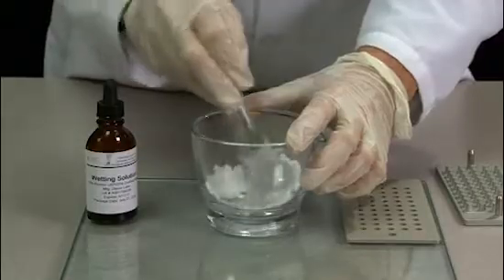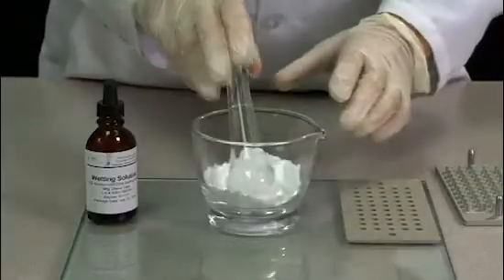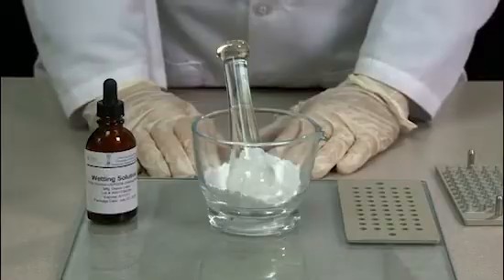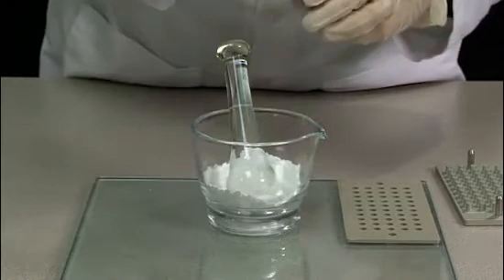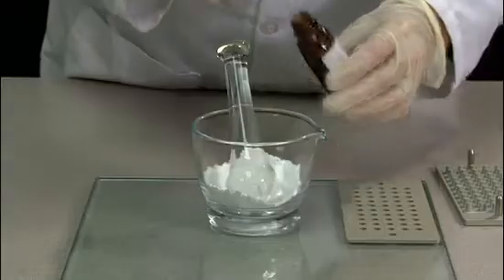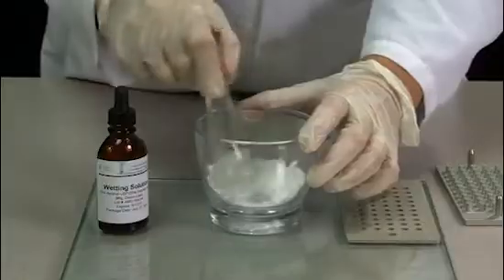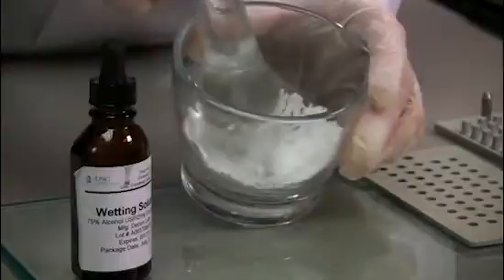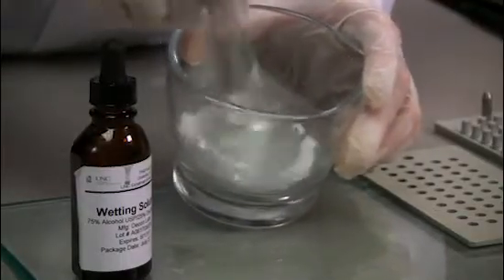What we're looking for in this particular process is a time when the powder is wet enough that it will adhere to the pestle, but not so wet that we start to dissolve the metoprolol. Generally, you can start with about 15 drops of the wetting solution. And you'll notice that the powder pack is changing slightly, but certainly not adhering to the pestle.